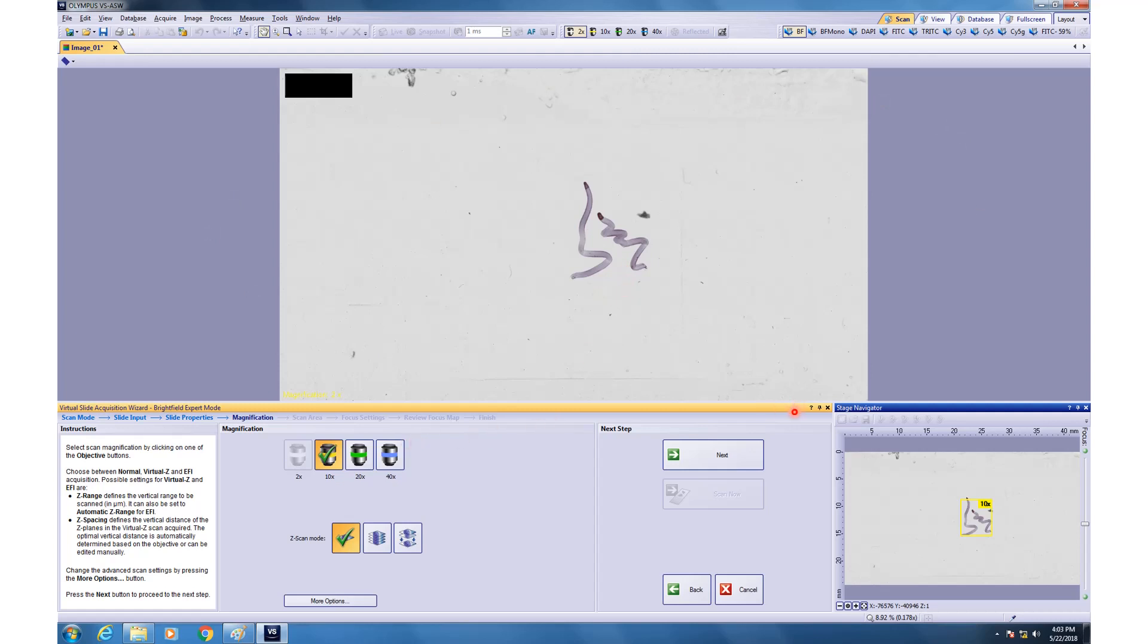After the overview is taken, now you have the option of choosing the magnification and the kind of z-scan mode that you want to do. If you are doing a 10x and just one plane, then you can choose this option. If you want to do other magnification, you can choose any of those. This is for the 3D data volume, if you have different z-stacks. This one will be useful if you want to create just one plane image out of that 3D. This is basically extended focus imaging. It will take a little bit more time compared to the first one but of course it will give you a better result.